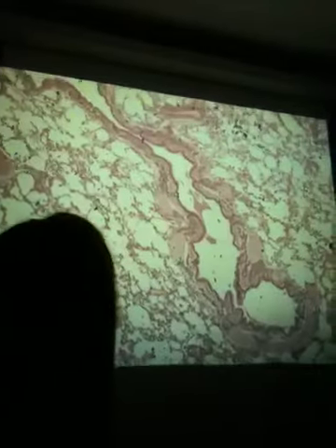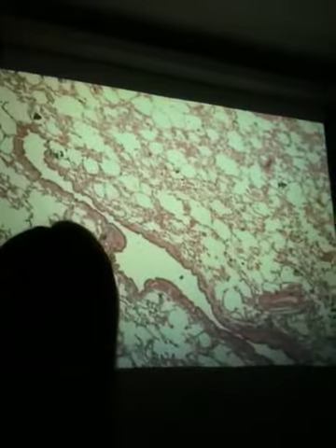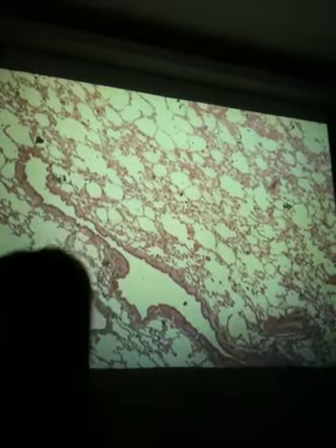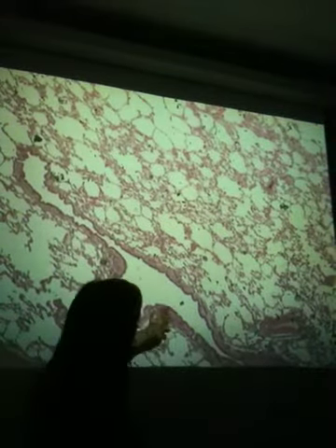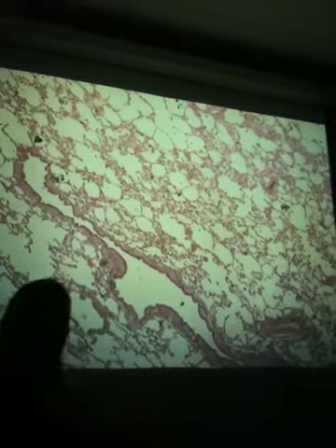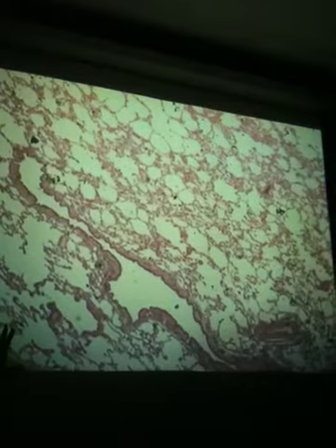If I look over here, it looks the same, but now we don't see any cartilage — this is a bronchiole. It's less about size, because once we section, size gets tricky, so we don't want to worry about size. You really want to look to see whether or not it has cartilage in the walls or not.